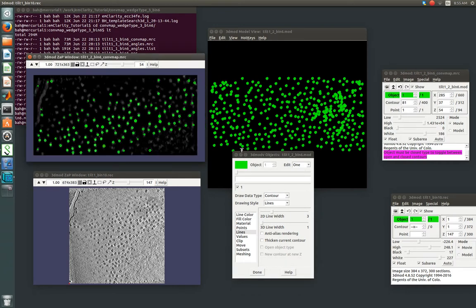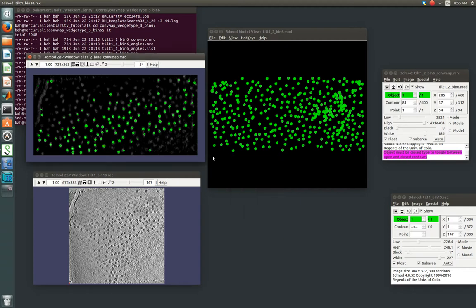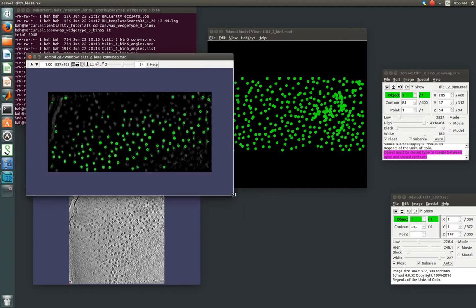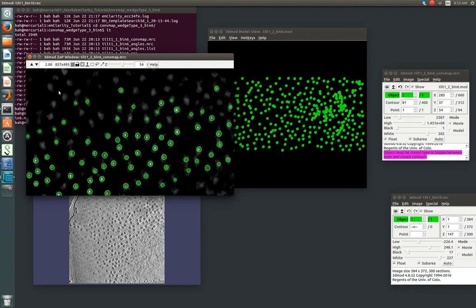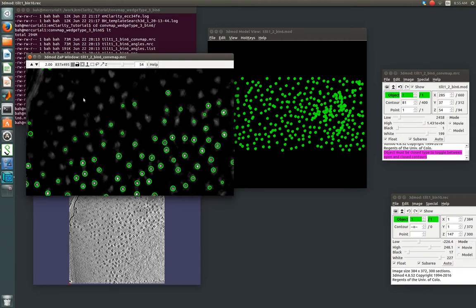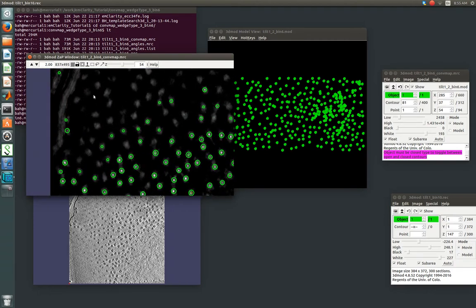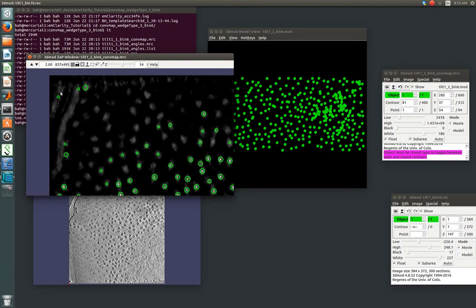So that's the setup. Now, on to editing the model. So there's a couple different ways we can do this. In the overlay with the convolution map, we can come in and for features that are like membranes or whatever, if you use in model view.